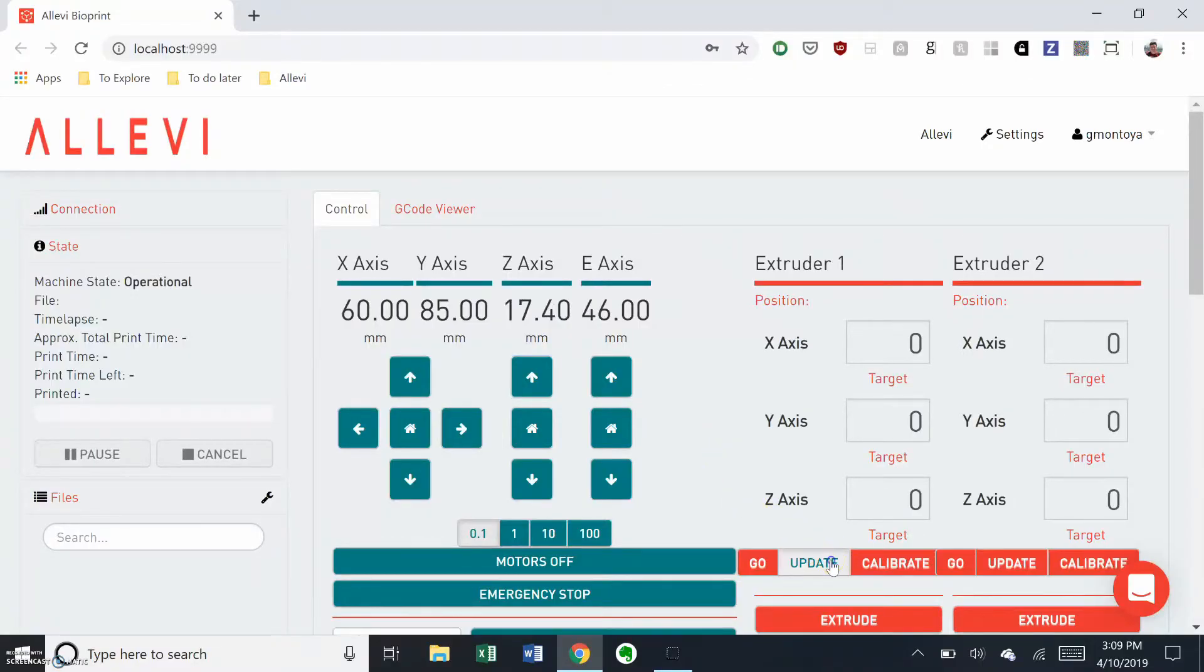Once you're at the right level, click update and make sure the values match. Then, click calibrate.